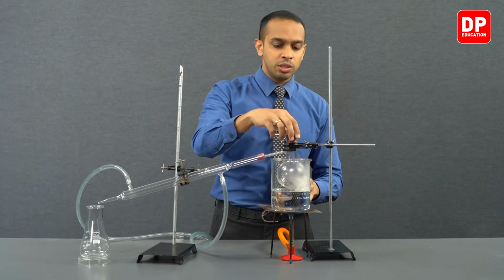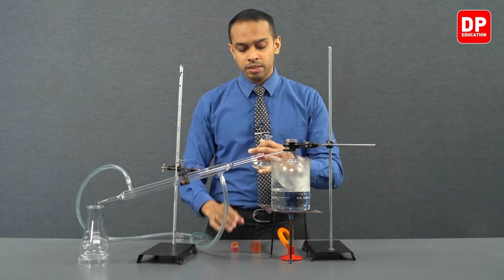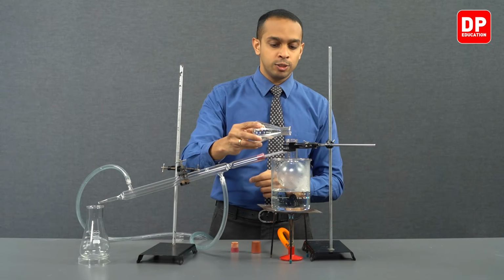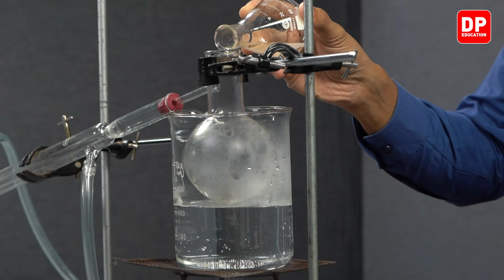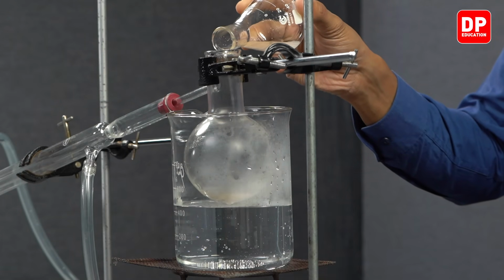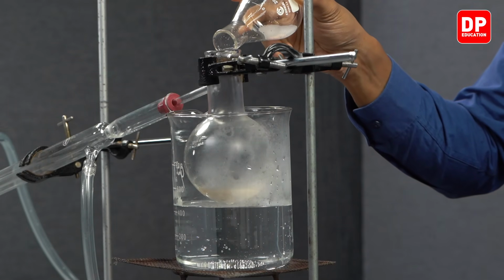So we can proceed to decant this very carefully and add our diethyl ether layer slowly into this distilling flask. And we'll be adding it into this distilling flask, making sure the sodium sulfate does not get transferred into our distilling flask.